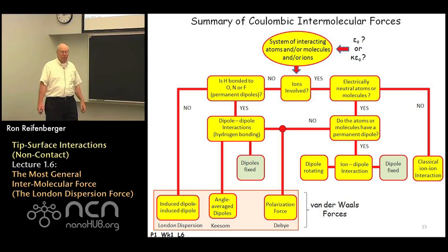This summarizes the van der Waals forces that arise when atoms or molecules without permanent dipole moments interact one with respect to another. And it's these van der Waals forces that are going to contribute the dominant interaction between the tip and the substrate. So the end result of this discussion is an appreciation of these three different forces, and we're going to now use the insights that we've gained from discussing this.